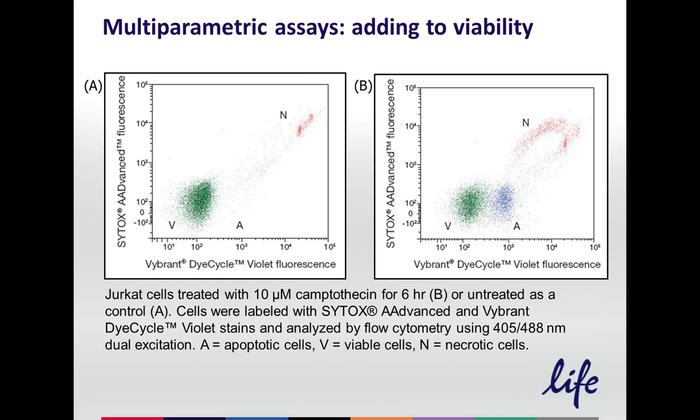Now, these can be discriminated from your normal DNA segregation that you'd see throughout the cell cycle, and if one was to plot frequency against just raw Vybrant DyeCycle fluorescence, you'd see the G1, S, G2/M peaks being discriminated from these apoptotic ones. And in these camptothecin treated, you can see that apoptotic population marked in A and blue will then transition into that necrotic death, where the fluorescence of Vybrant DyeCycle Violet increases, as does the SYTOX stain, showing that now the membrane has been compromised.